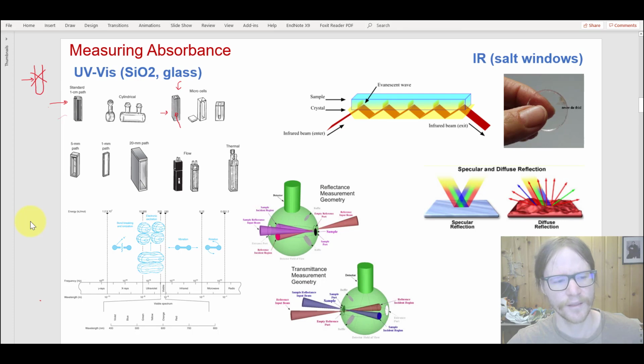In terms of the region of the EM spectrum that you're going to measure absorbance in, as I alluded to before, if you're measuring visible light, then you can get away with acrylic or glass. If you're measuring UV, then you need quartz, which makes it much more expensive. Quartz takes several thousand degrees to blow, because it's crystalline and non-amorphous, rather than like soft glass, which may take 600 C to blow. And so it's industrially a much more challenging manufacturing process.